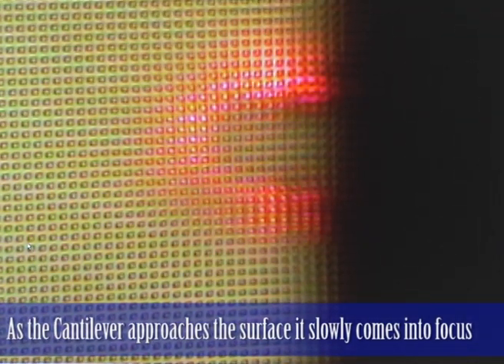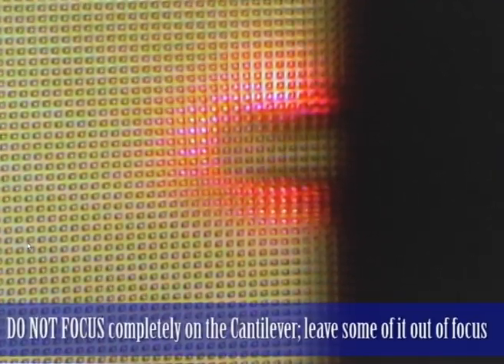I don't want to bring it completely into focus because it will contact the surface there.